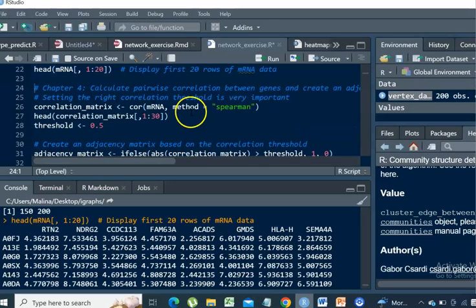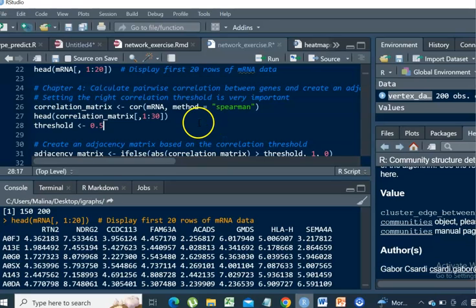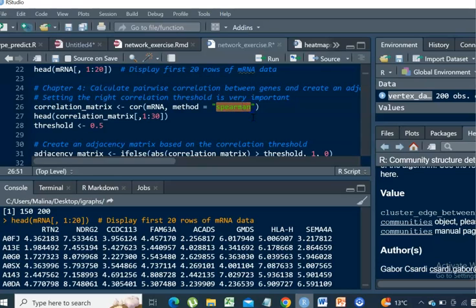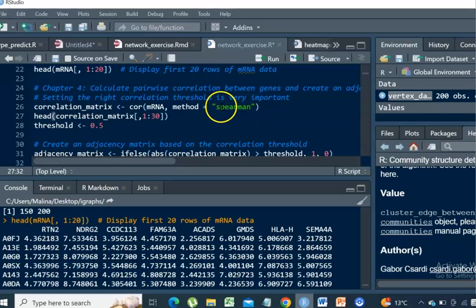What we need to obtain in order to be able to build the network is the co-expression score between these genes. In our case, we are going to estimate the correlation score between the expression levels in each pair of genes. We are going to use Spearman correlation because usually the distribution of the data in RNA-seq is not normal. And Spearman is more appropriate than Pearson, which runs a linear test. It expects the data to be normally distributed. And in Spearman, the data is ranked in advance prior to the performance of the test for correlation.